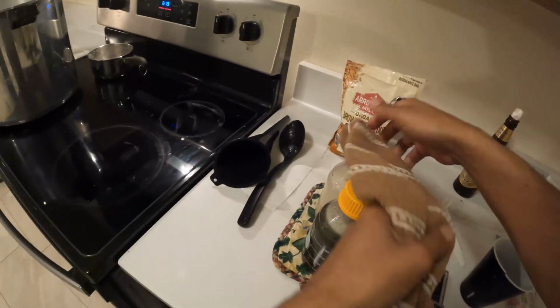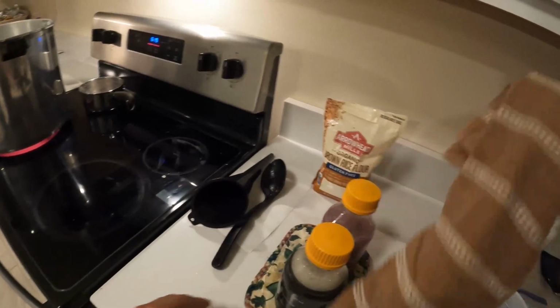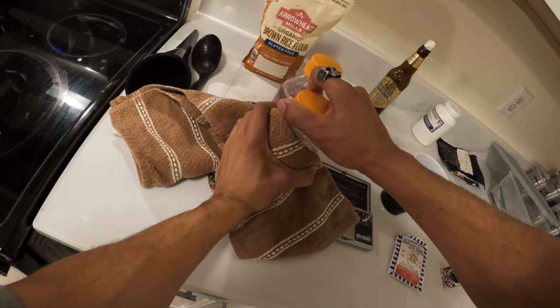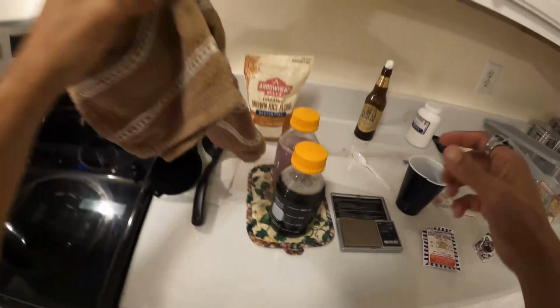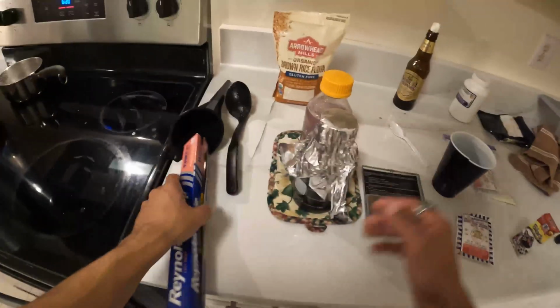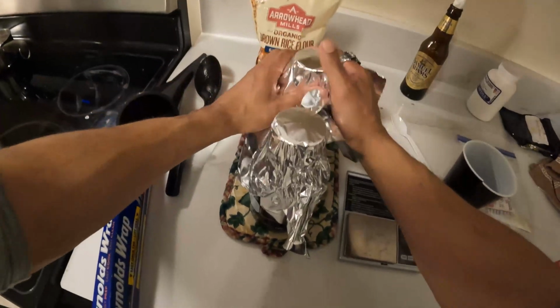Okay. And shake up this purple. Sorry if I got y'all earthquaking. But I'm going to show the method as is. You will take this cap and you'll just loosen it just a tiny bit. You don't want it super tight. So just loosen it just a bit. And we'll take our foil. There's number one. And there's number two.